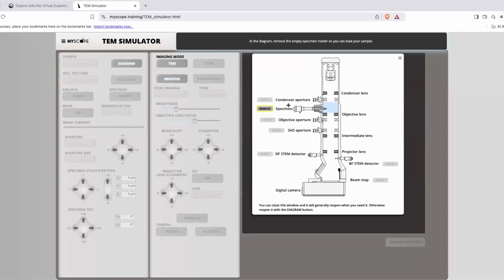So what you see here is the structure or schematics of a transmission electron microscope. Very complex, but this is a simplified version. We have a beam of electrons, and then there are a lot of lenses, more lenses than in a scanning electron microscope. We have a sample holder, and then there are detectors: a camera, digital CCD, or direct electron detector.